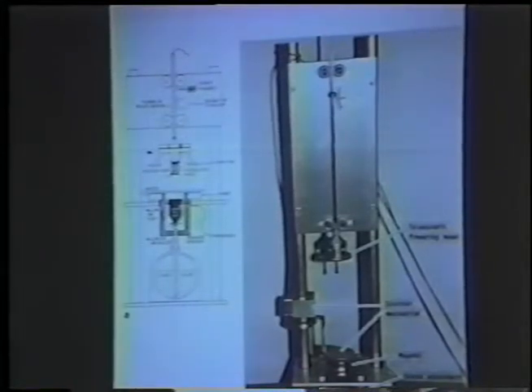Then the sample contacts whatever you're using as the heat exchange medium, the cold metal block or the liquid cryogen, whatever. And so since you have ice on the outside, ice is a good conductor of heat, and the next region freezes well. And then deeper than that, you can't withdraw heat quickly enough to prevent ice crystal formation, so you have ice crystals. So you get ice crystals, well-frozen material, and ice crystals, a three-layered effect, if you pass through a region of cold gas, or otherwise generate a pre-freezing artifact.